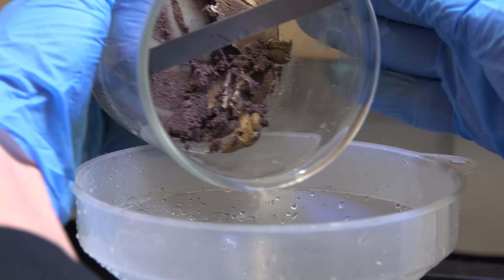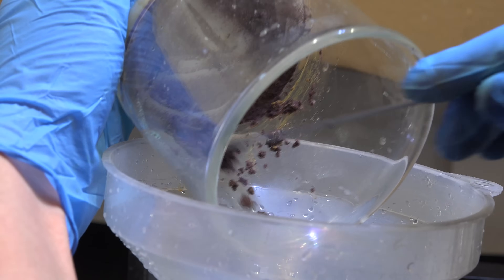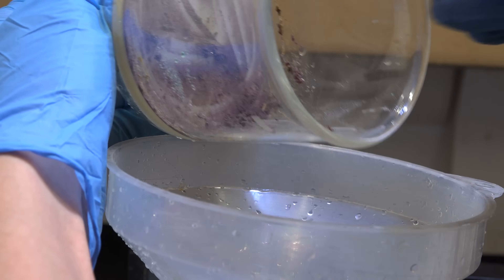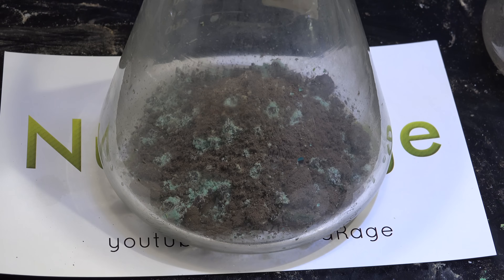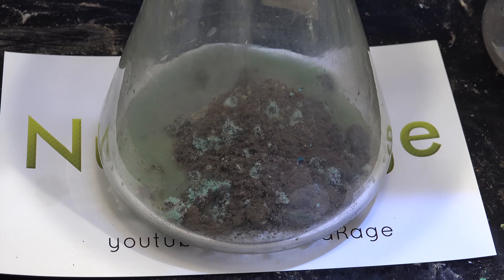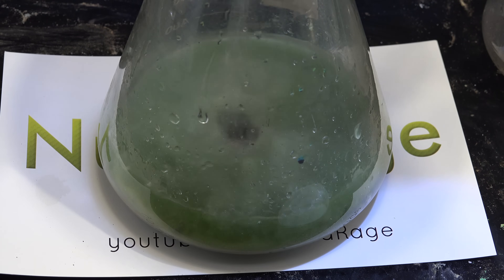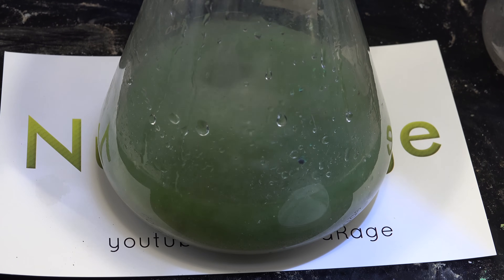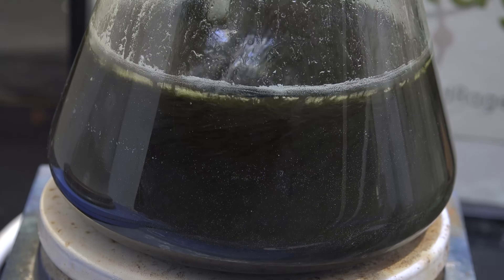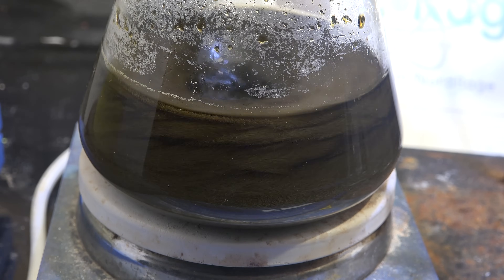Mix all the copper residues in a flask. The copper sulfate in the distillation residue will feed forward to help make more sulfuric acid in the next run, so you don't need to worry about it building up. Once you've gathered all your copper chloride, add the hydrochloric acid that was distilled earlier. You may need to top up with extra water, as the sulfuric acid carries away a small amount in its formation. Now bubble air through the mixture to regenerate the copper chloride, and once it's dissolved you are ready to reuse the copper chloride to make more sulfuric acid.